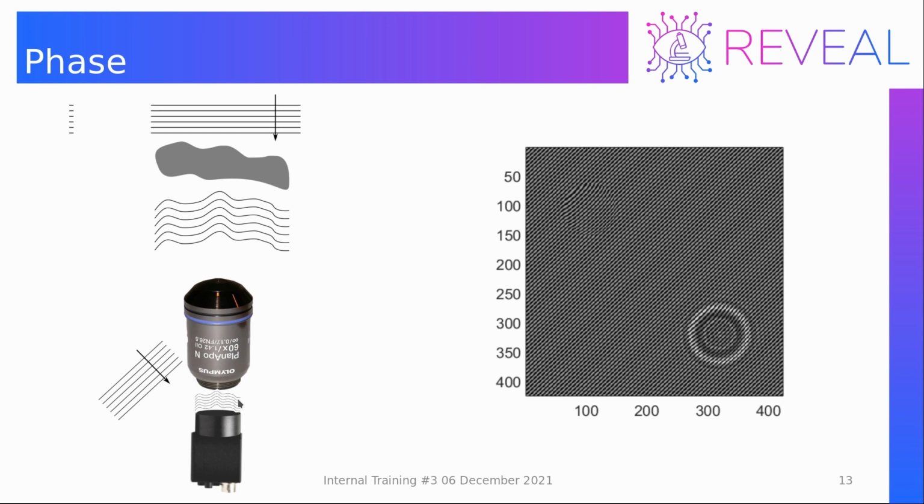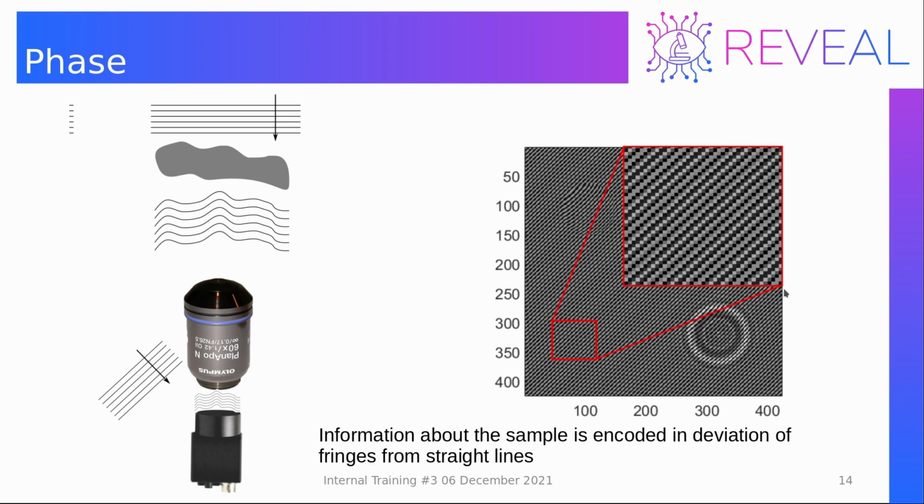So this plane wave interferes with this object wave at the camera plane, and as a result it creates fringes at the detector. You will immediately see fringes, and when you look closely at these fringes, you will see that these are cosine fringes. In this direction it is like a cosine function.